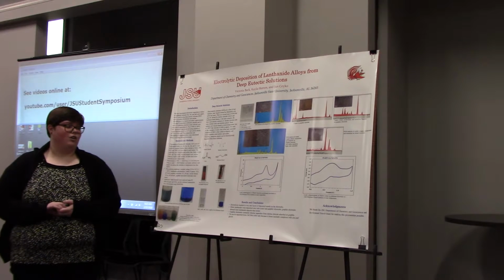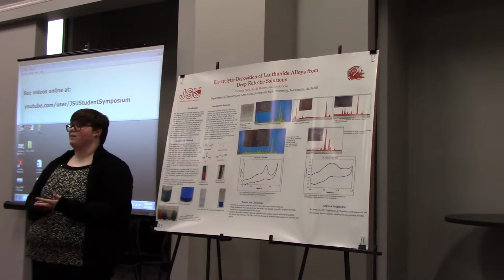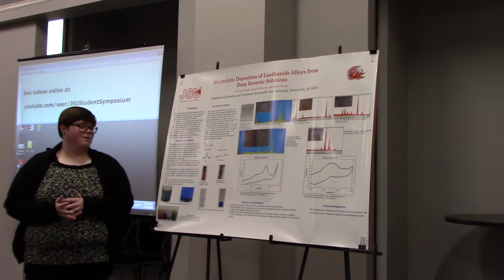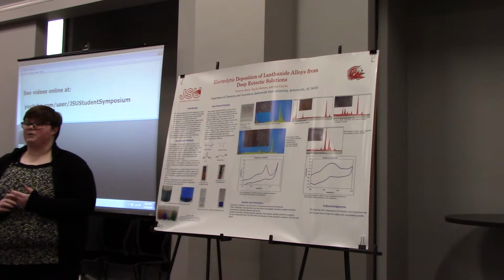We analyzed our metal deposits using a PC microscope and scanning electron microscope, and the elemental composition of the deposits was determined using scanning electron microscope, but particularly EDS, which is energy dispersive X-ray spectroscopy.